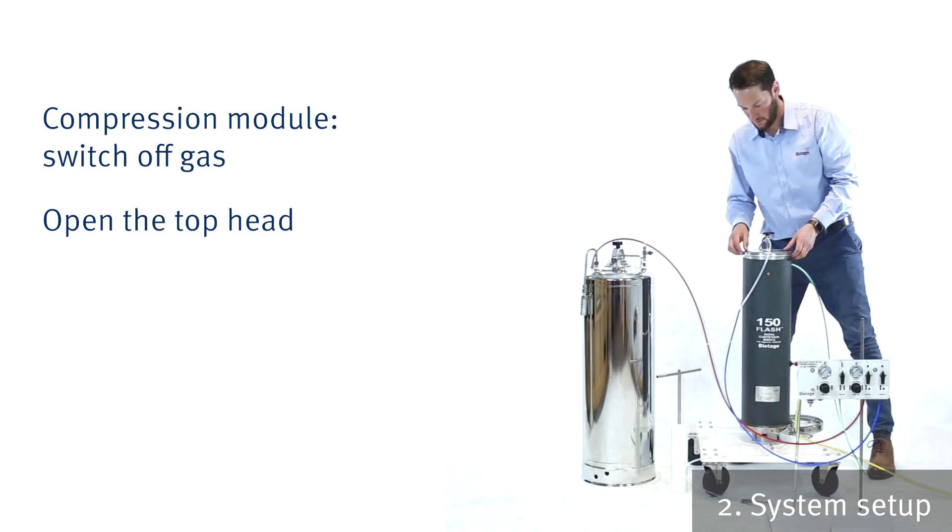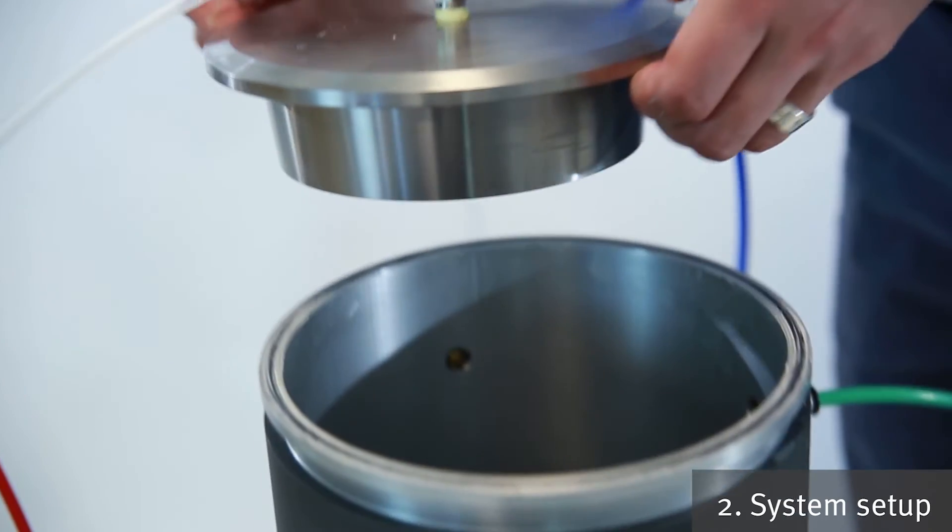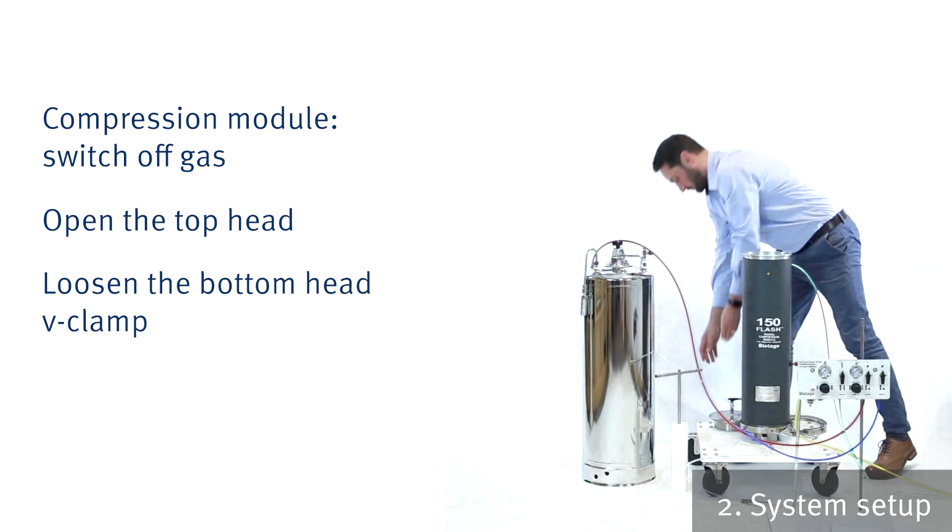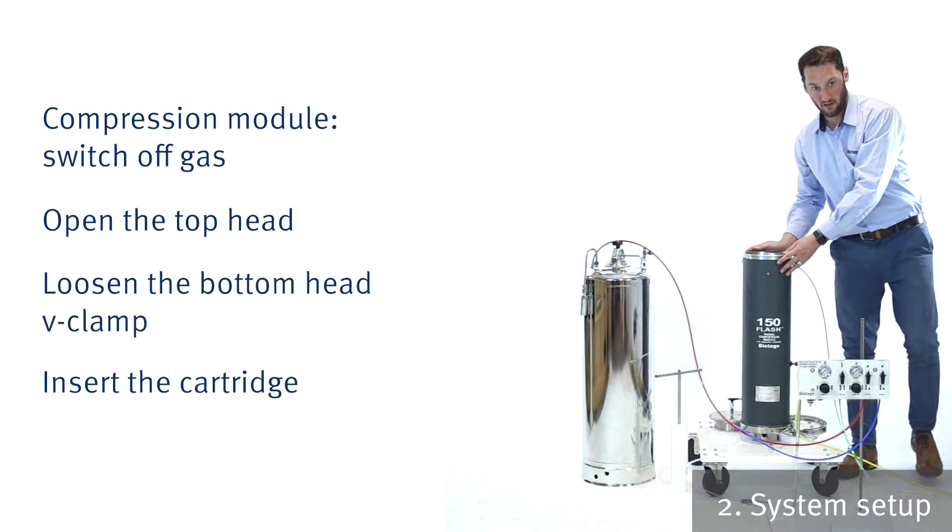So now you need to take the top head off. Be careful, this is quite heavy. For a new system, there's going to be a bit of grease on there as well. So now that's opened up, we can go and get the cartridge.